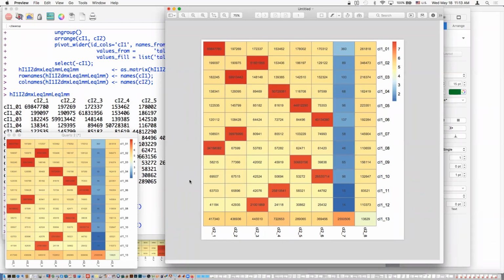Maybe these numbers look small to you, but remember that it's really the whole sum of the row that should matter, right? So these individual squares are like 100,000, 200,000. And some of these libraries are like 20 million or something like that. And then I've got to do like 5 of them. So 5 times 200,000, it's almost a million there, right? So now it's like a million versus 20 million.